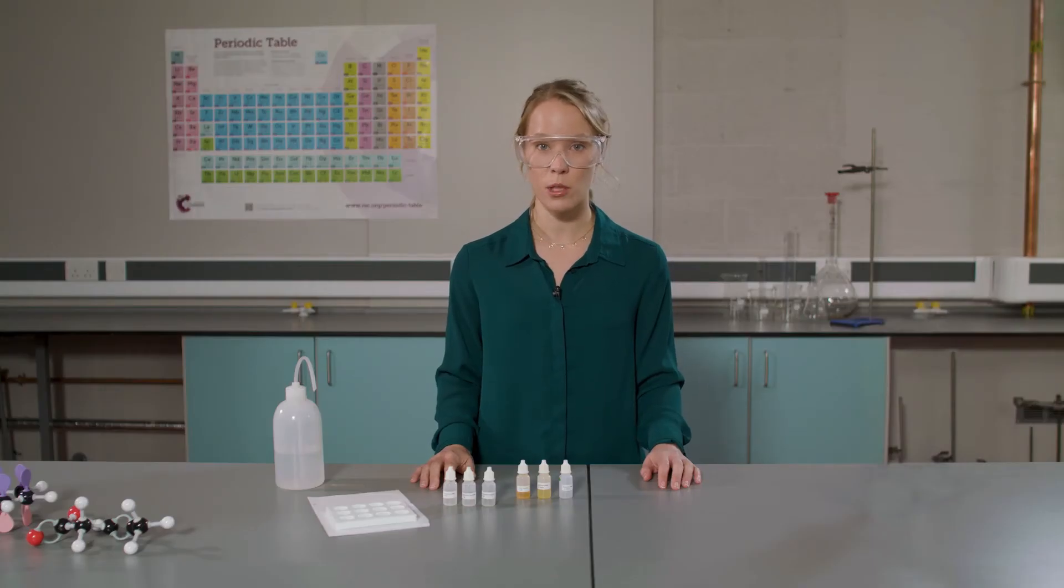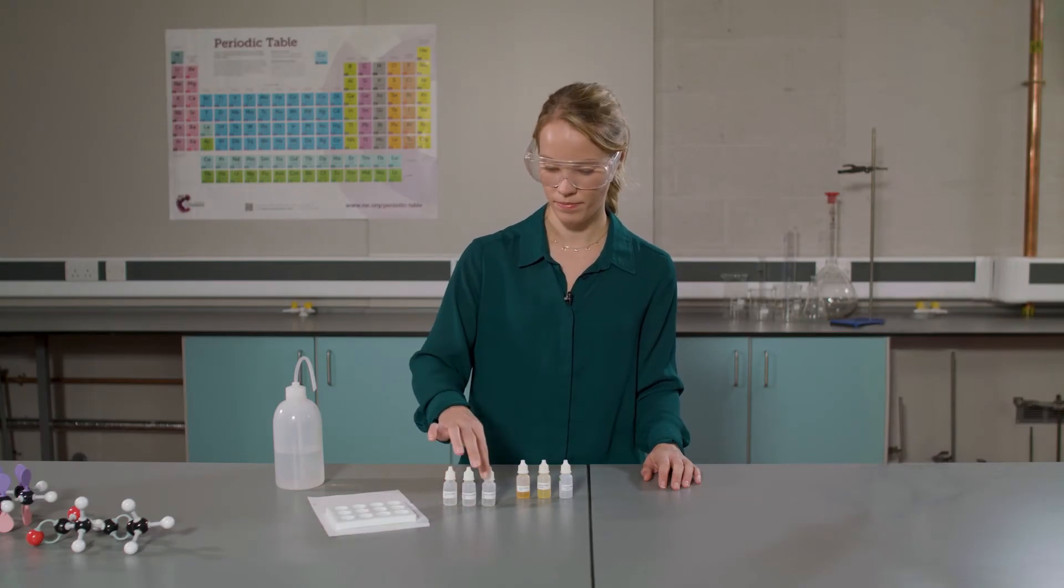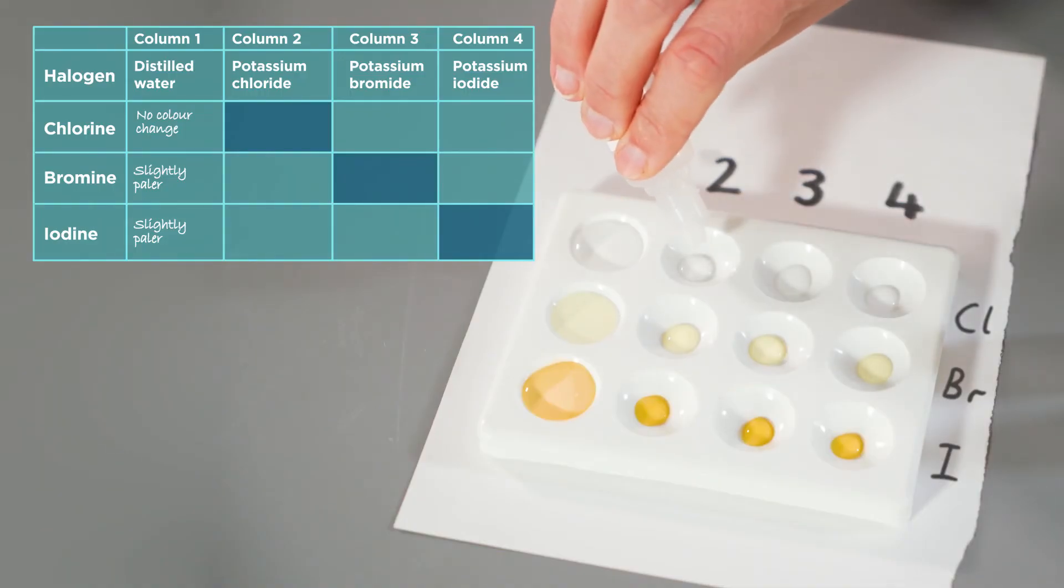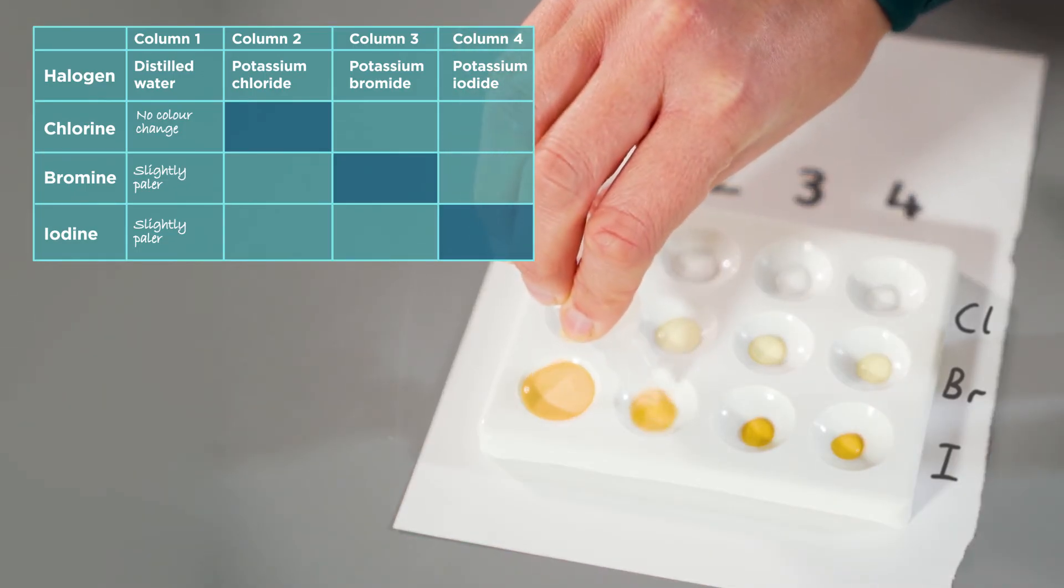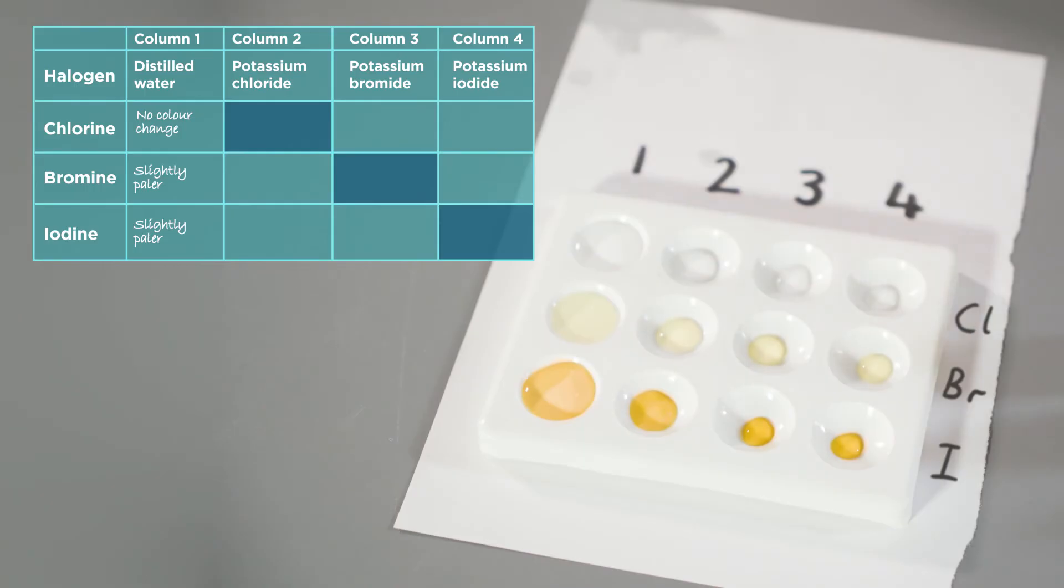Next, I'm going to add potassium chloride to the second column. Carefully observe and note down any changes. Here we can conclude that no displacement reactions have taken place when potassium chloride is added to chlorine, bromine and iodine water as the colours have not changed.